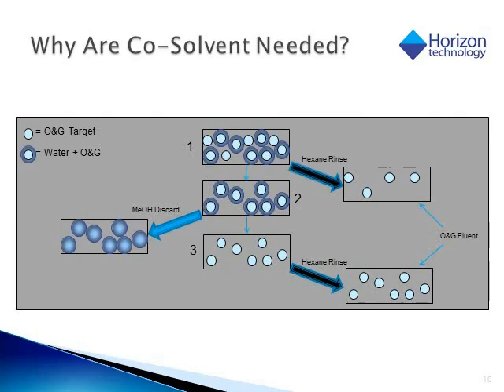Think about it. We process an aqueous sample which has all sorts of stuff in it, including leaves and dirt and God knows what else. Then we squirt hexane on top of it and just expect the hexane to go through the water to get to the target oil and grease. This is a recipe for low recoveries.